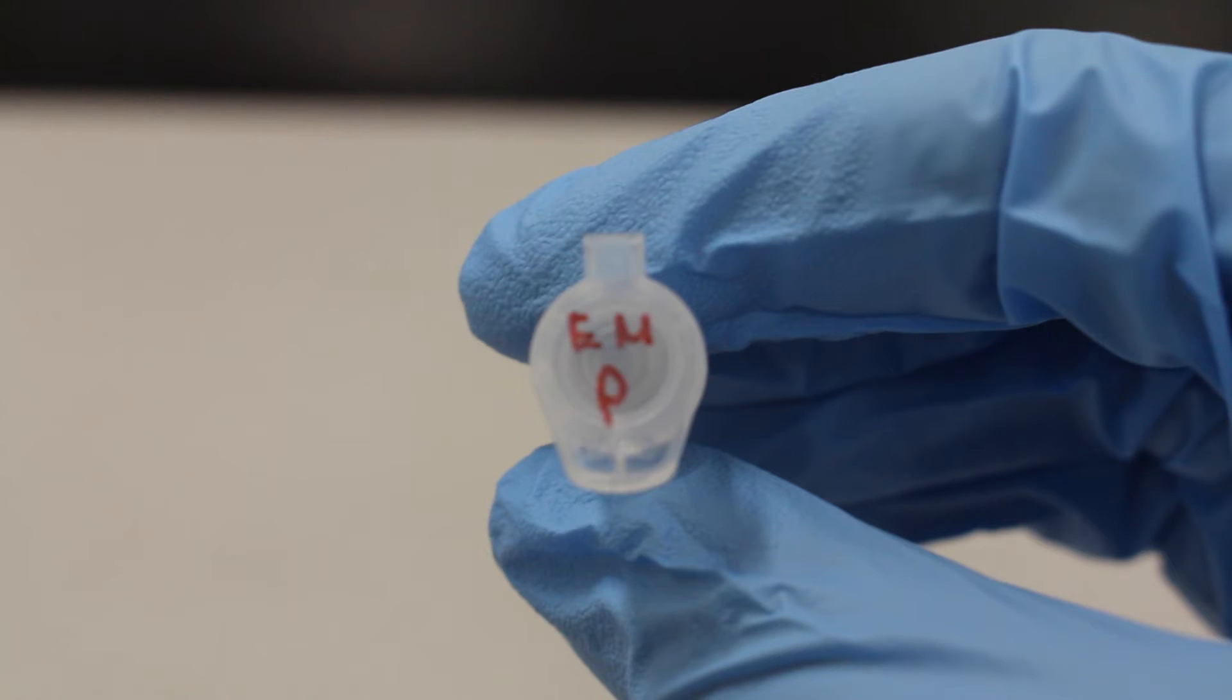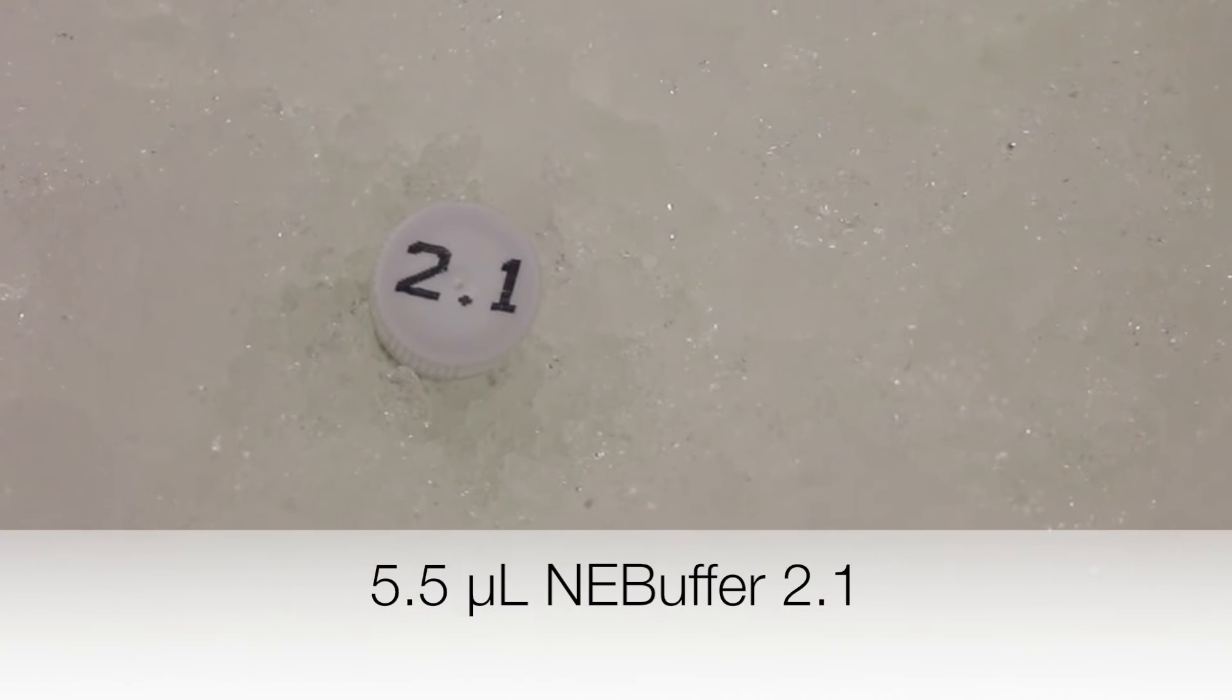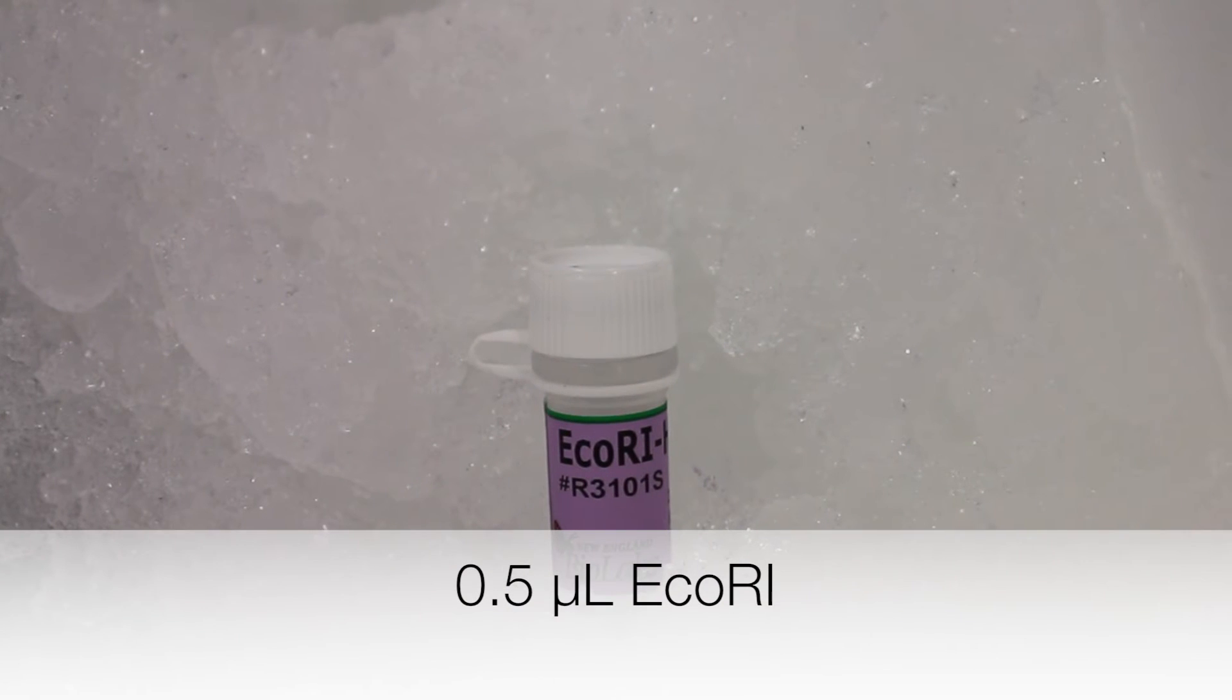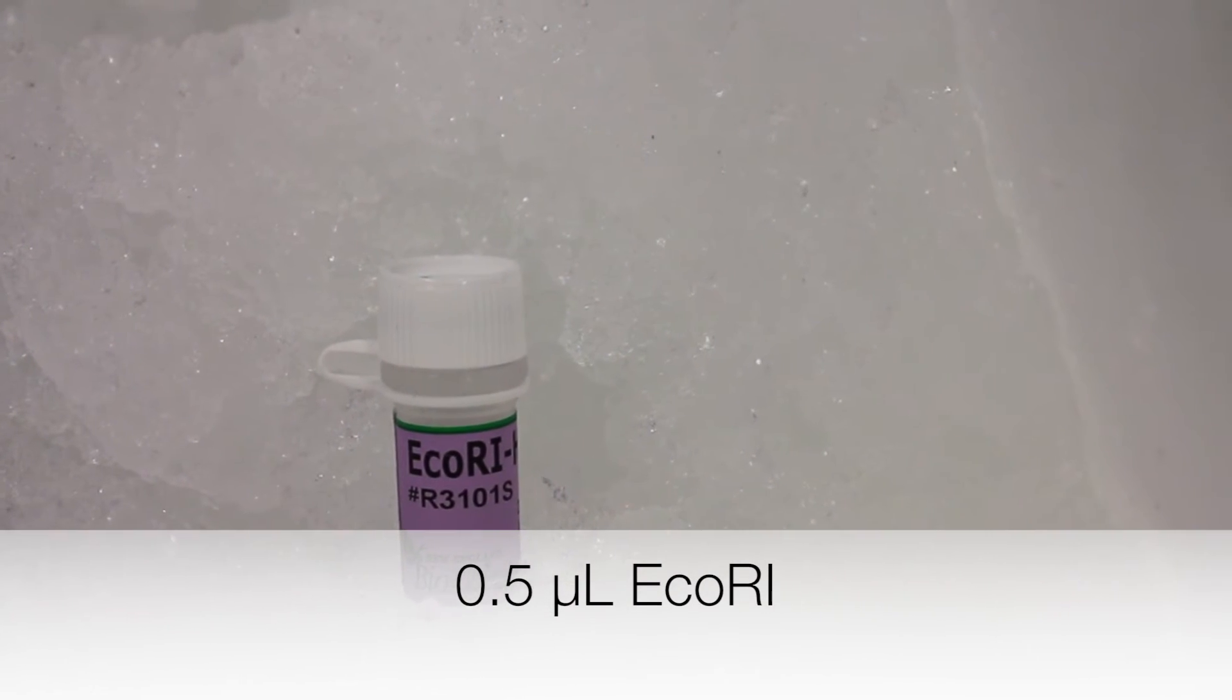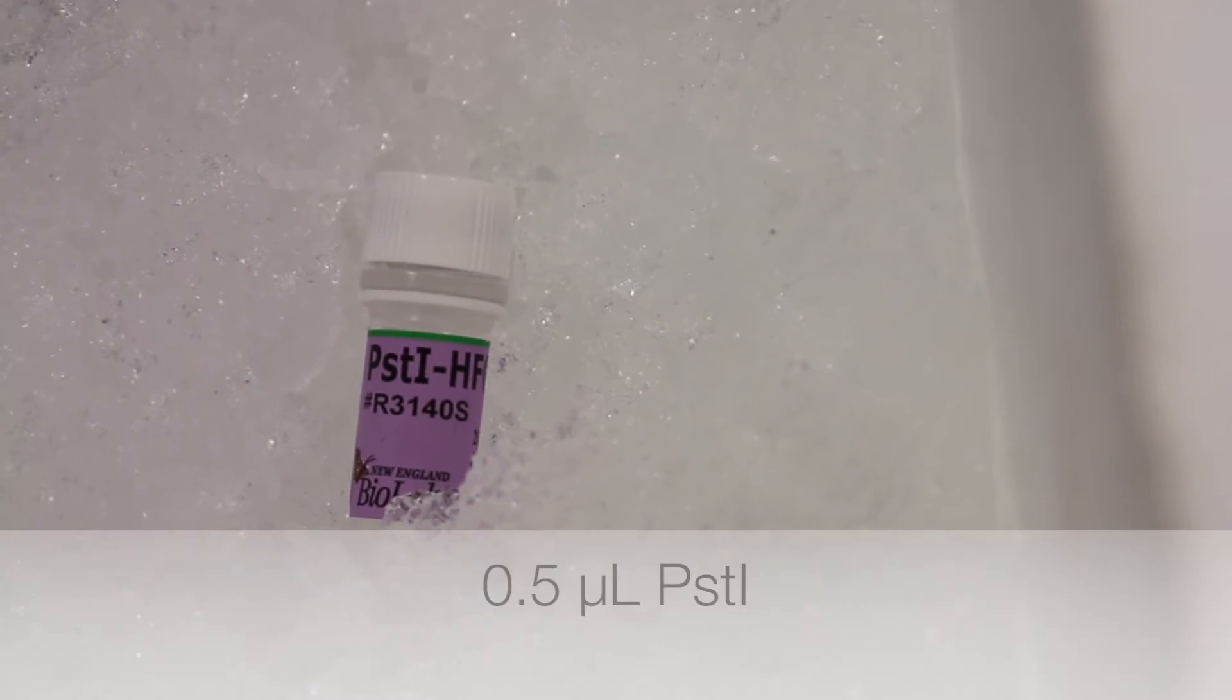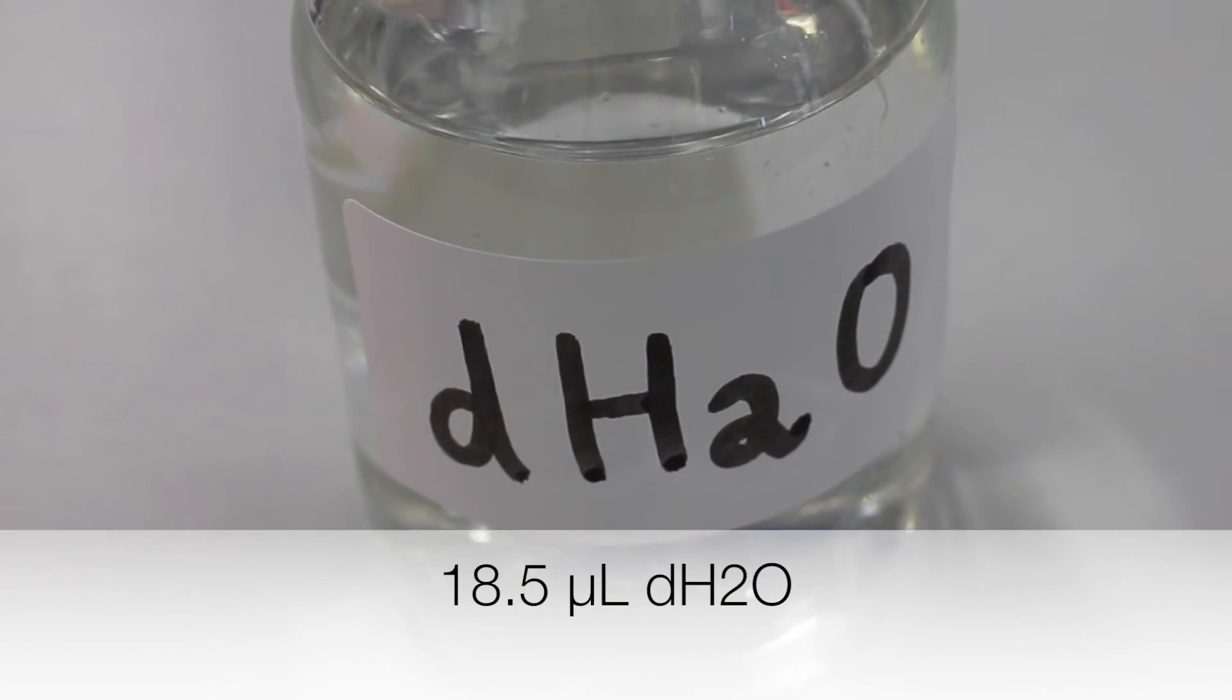The enzyme master mix for the plasmid backbone will contain the following: 5.5 microliters of NEB buffer 2.1, 0.5 microliters of EcoR1, 0.5 microliters of PstI, and 18.5 microliters of distilled water.